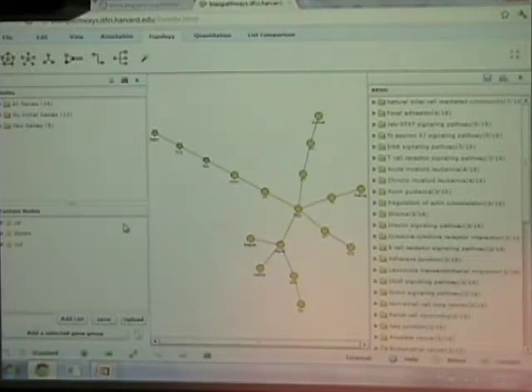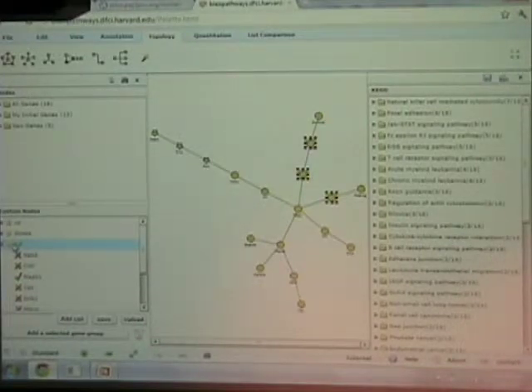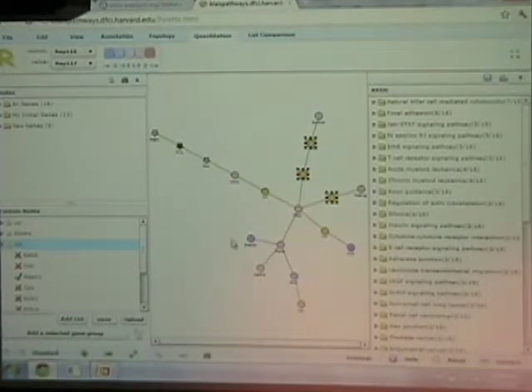And so what the system is going to try and do is connect things with the database of facts as they exist right now. There will be a need to bring in extra proteins to bring all of this together. And a fun game you can play is to ask how many of the things that we cut out before did we bring back? So we brought back 3. In other words, in order to connect this data, it made sense to add these 5 proteins, 3 of which were what we cut out. So that's sort of a fun little observation.